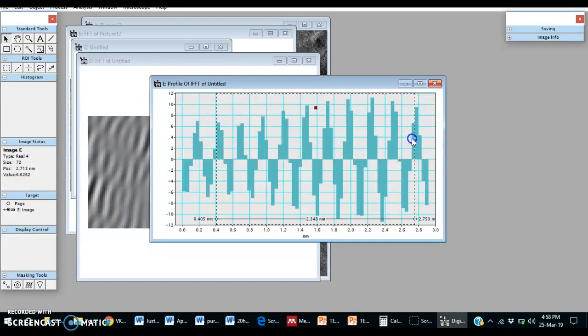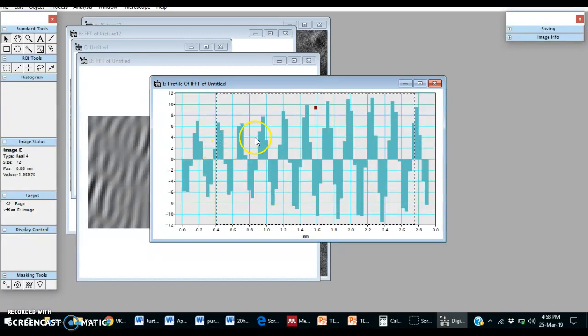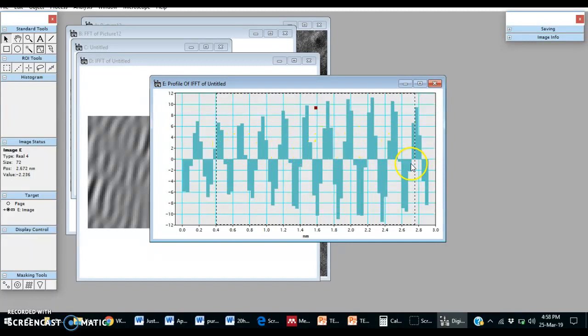This distance is 2.348 nanometers. Note down, then count: one, two, three, four, five, six, seven, eight, nine.